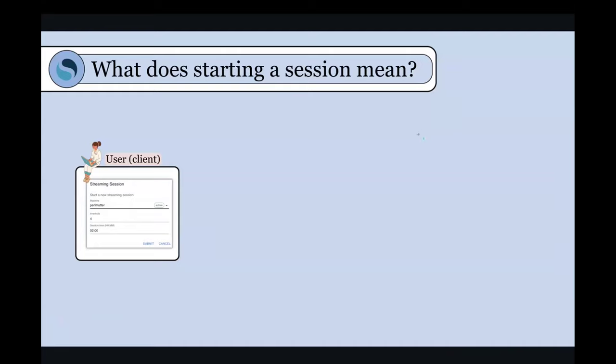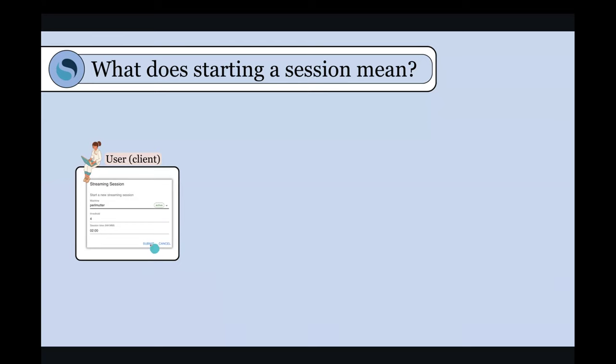So for some of you, you might be wondering what's really happening when I'm starting a session. So the user, when they click this button to start a session, they'll see this dialogue window. And you can see here that it says active. This is a machine, Perlmutter is active. If Perlmutter was degraded or down, they would also see this kind of status here. This is using what Bjorn just talked about in the super facility API to check whether Perlmutter is up or not. If it's not there, then they can't submit a job. So when they press the submit button, what's going on is it's sending a message to the distiller backend, which creates a job in the distiller database.